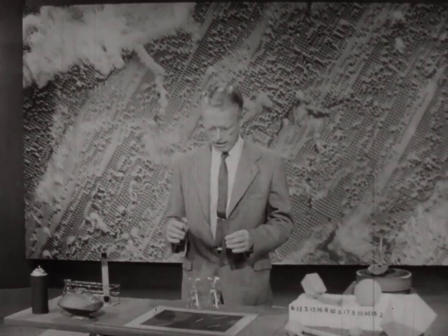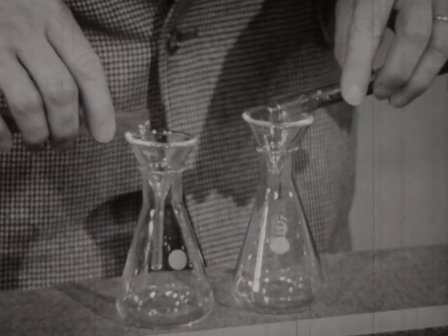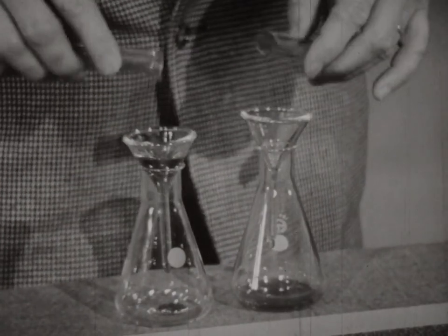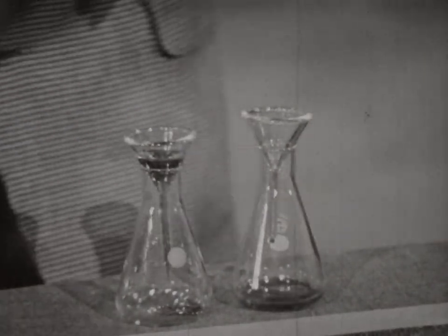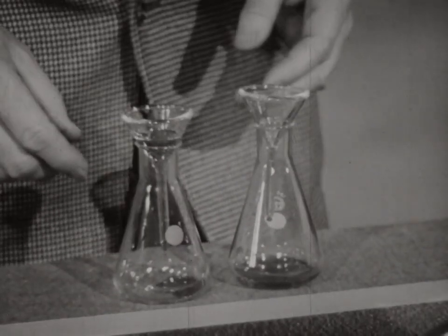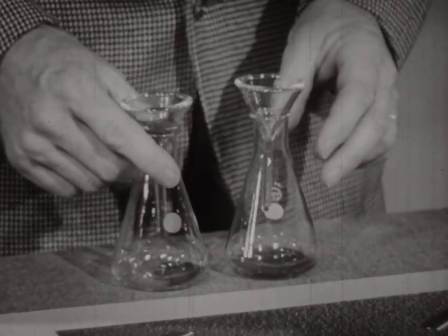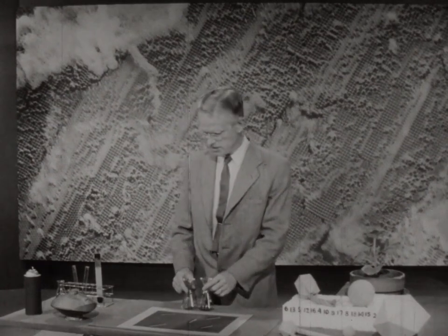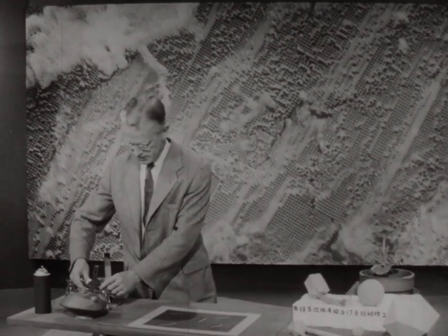And I have a couple here. One is just water. The other one is water with some very large molecules in it. And the presence of the large molecules means that the one on my right pours much more slowly than the plain water will pour. Now, if we can measure quite precisely this pouring rate, we have an idea of the viscosity of a virus solution, and that gives us very good ideas of the shapes and sizes of the virus particles.